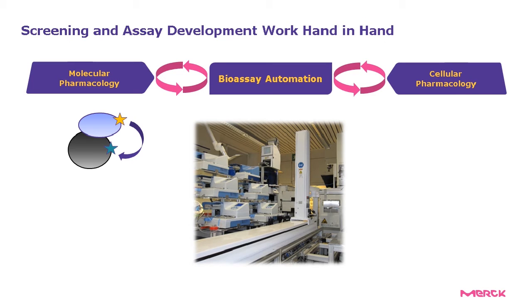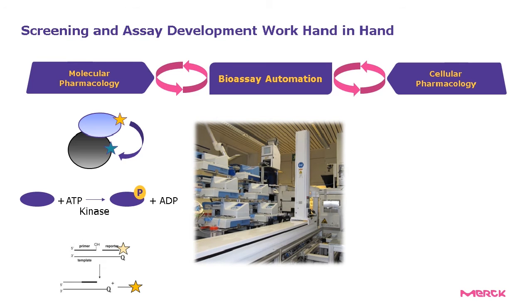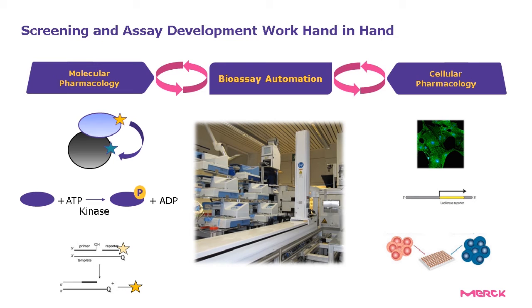So in molecular pharmacology, it's the biochemistry side of assays. We are setting up all kinds of different assays, such as protein-protein interaction assays, or functional enzymatic assays, such as kinase assays or enzyme assays for DNA or RNA modifications. In cellular pharmacology, assays such as imaging-based assays or reporter gene assays or co-culture assays, just to name a few, are being developed.